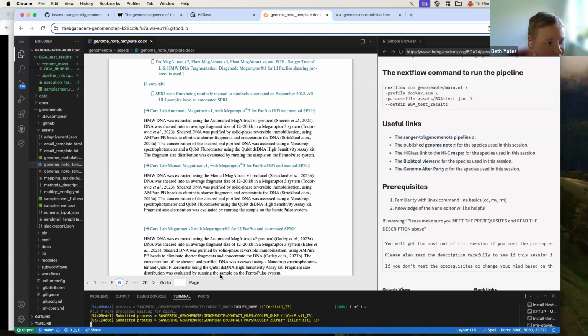So I'm not quite sure what's happening today. It very much varies though when you're running for the entire assembly, for the full data set. Sometimes it's a few hours, sometimes it's a day. I don't think we've had many that take much longer than that. I've not been doing the production runs, so I don't have that data, but I think most of them are within a few hours, so maybe 6 or 7 hours. It's very dependent on the genome size. I don't think I've got average statistics right now, but I think the average is far below 12 hours.